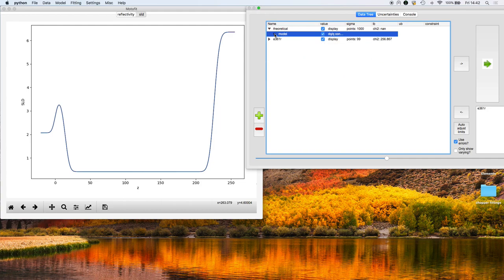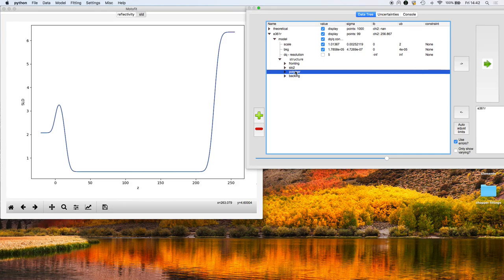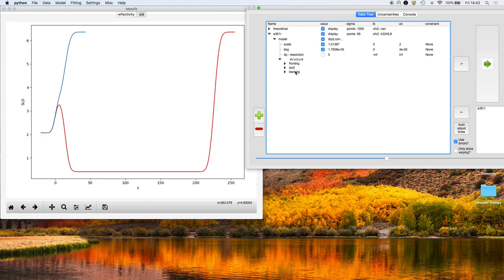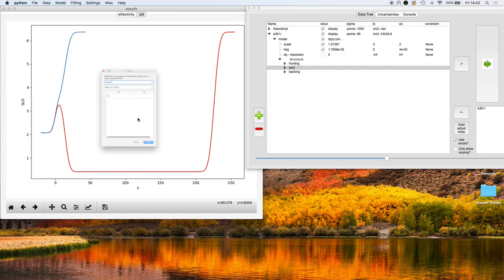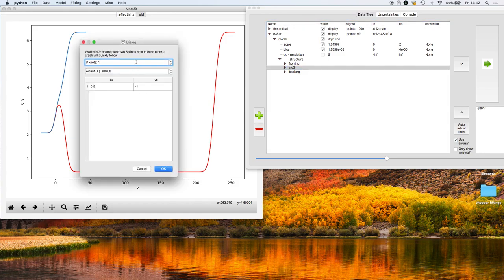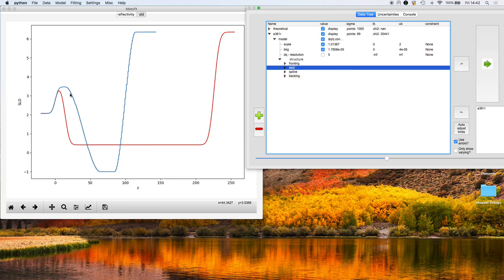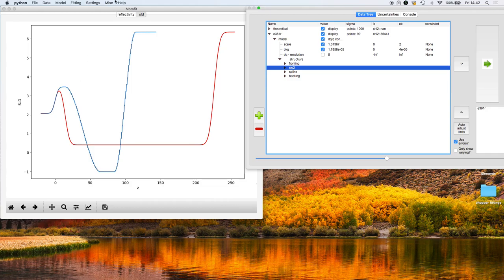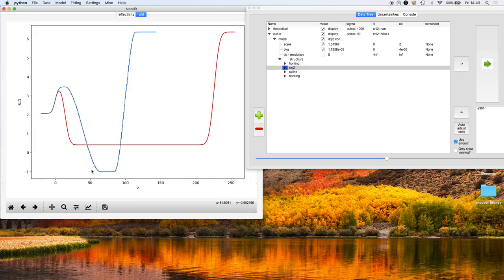I'm going to compare against that original model. The first thing in demonstrating this spline layer is to get rid of the polymer slab. I'm going to add in a spline component with three knots. The spline component appears and we now have a region that has loads more steps. The scattering length density profile is smooth but approximated by a whole series of steps.